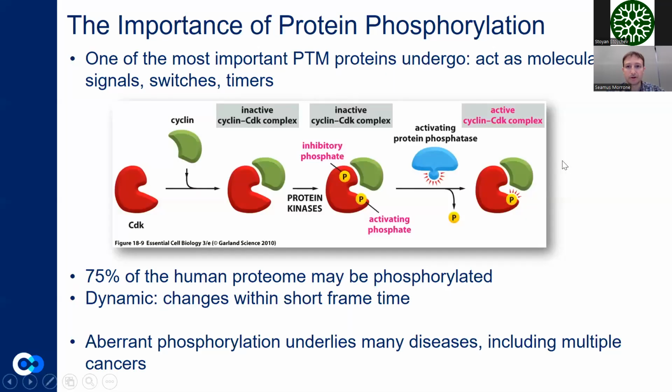So I'm sure we're all aware of the importance of protein phosphorylation. It's one of the most ubiquitous and arguably one of the most important post-translational modifications that proteins undergo. And it has a diverse array of roles in all domains of life. It can act as molecular signals, switches, timers, structural components.